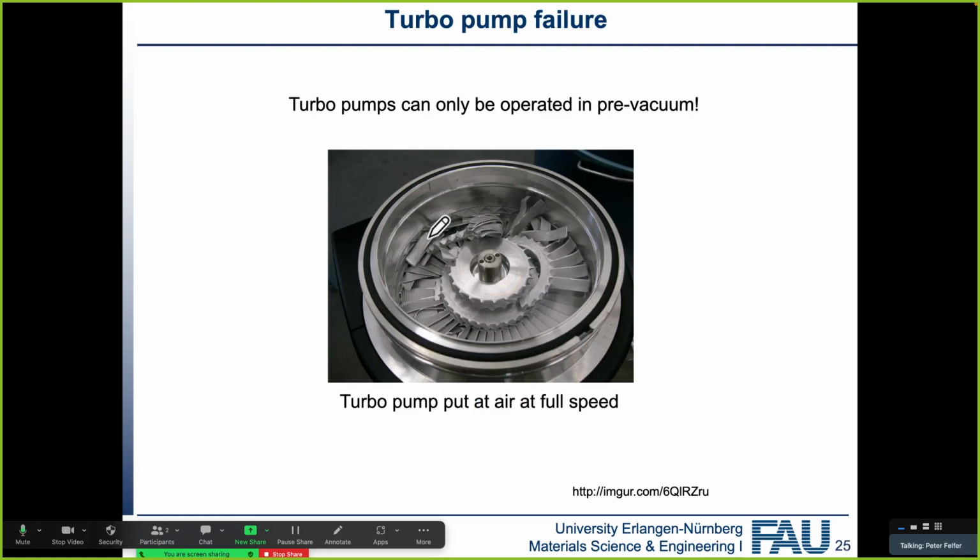Yeah, and this is what happens if you have a turbo pump failure. And if you want to see a failed turbo pump, you can go into Heinz Werner's office. He has one from back in the day when our old SEM had some issues with gas coming in too early when you vented it, and eventually the turbo pump blew up as well. And not as violent, so it didn't take the entire SEM into its grave with it, but you can see if something looks like this, and it broke at 1,500 hertz, 90,000 RPM. You can imagine parts flying around in the chamber being a problem.